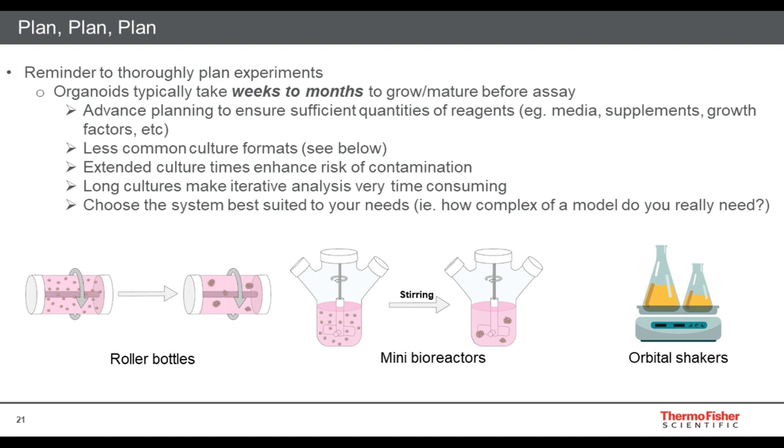model system. So the reason why this is certainly something to plan for is because these things take up different amounts of space in a typical cell culture incubator than simply putting plates on a shelf will typically do. So the space required to grow these is certainly something different that definitely requires planning for, especially if this is not the only thing your lab is doing.